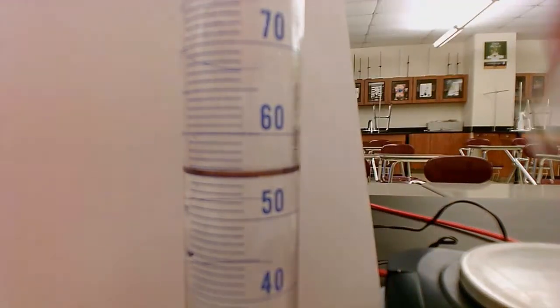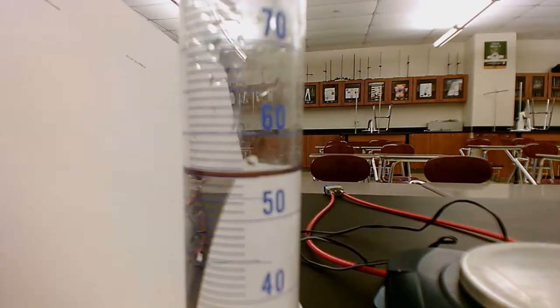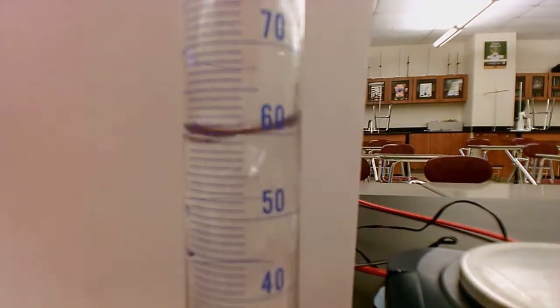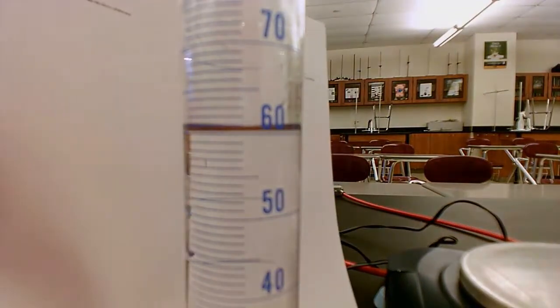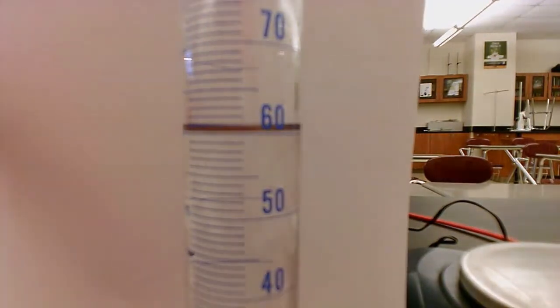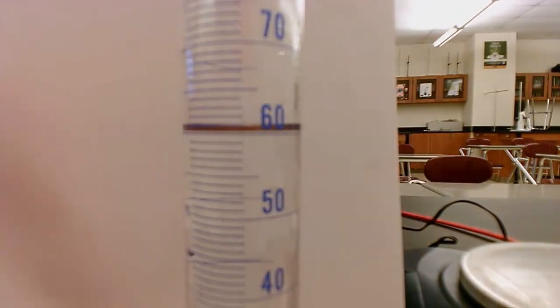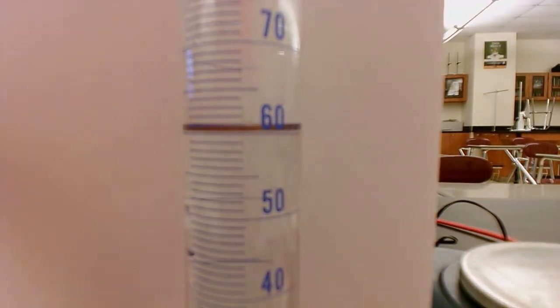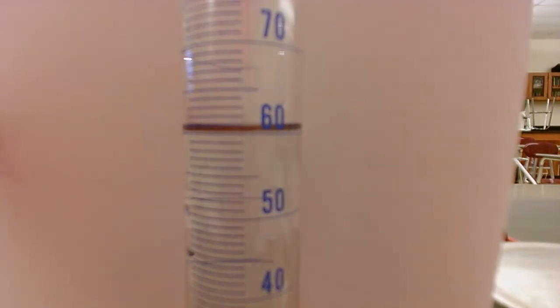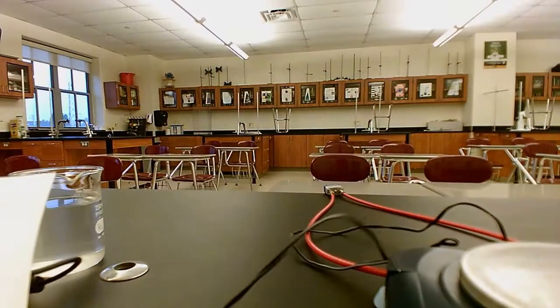Okay, I'm now going to pop C in. Now you are getting the volume of the water and solid. This is for solid C. And I'm sure you can pause this also if I'm going too fast.